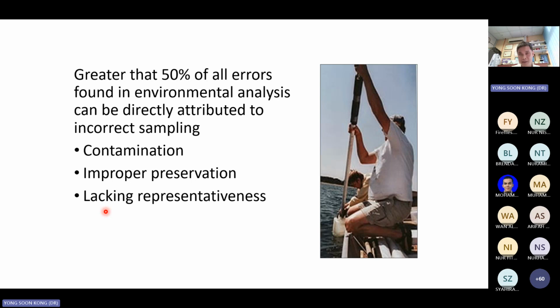These are the challenges for us who want to plan this sampling, because we can't take too many samples, but yet those samples have to be adequate, okay, not too big, not too small, enough to represent it. So these are the things that the QA and QC team needs to be mindful of. But basically, in order to represent the entire body, the sampling size has to be big enough.